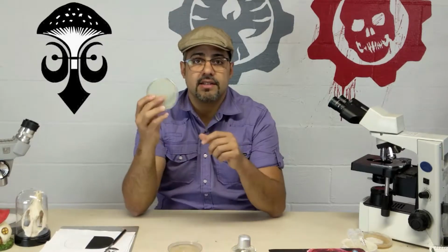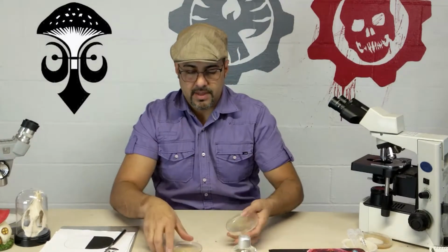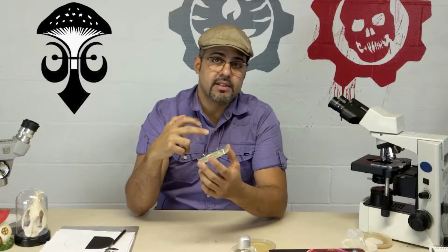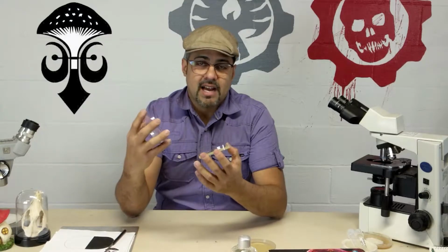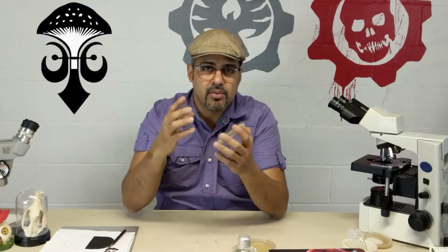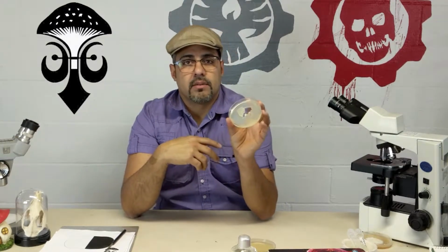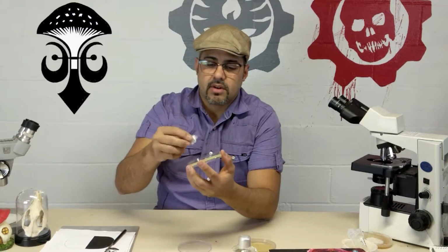Now, things that you should know by now is that this is a petri dish. How do we make the petri dish? Well, this is just plastic, right? And in here we put nutrients and a substance that we call agar. The agar is the agent that solidifies those nutrients, that broth, that liquid that has nutrients, and we get something like this. Texture, you can see it on the screen, is pretty much like jello.